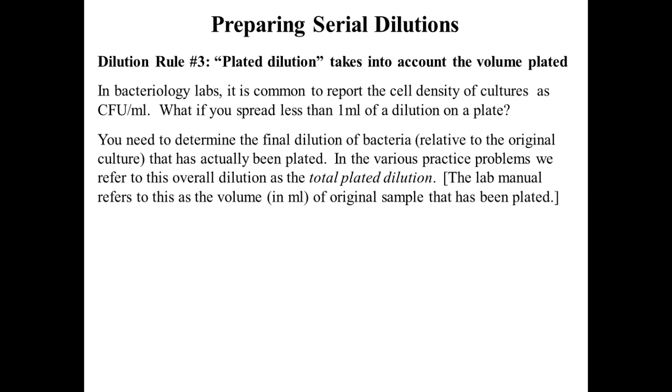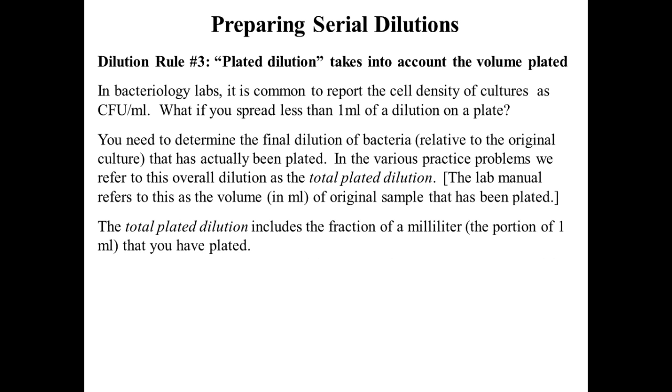So what do they refer to it in our lab manual as? Sometimes it's also referred to as the total plate dilution. The quote refers to it as the plated volume of the original sample. Basically, my total plate dilution of your very original sample. I'm being very specific as to what we're talking about, right? So this is the total dilution for that plate.